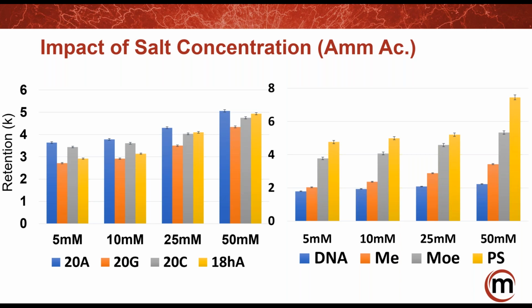But at 50 millimolar, we're getting needle thin peaks, but you can't put that much salt into your MS. We think we have a compromise around 15 millimolar where we sort of settled, or 15 to 25, depending on the application. And that was pretty much the case where there was a drop off between 25 and 10. So we think around 15 is acceptable.